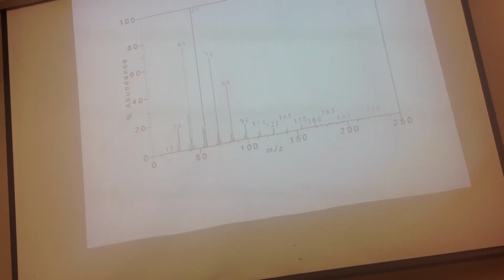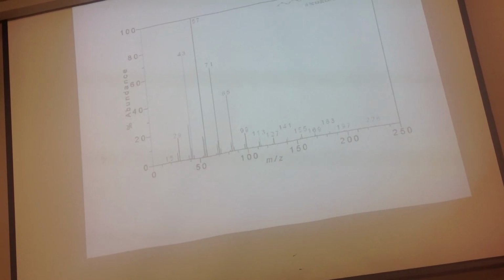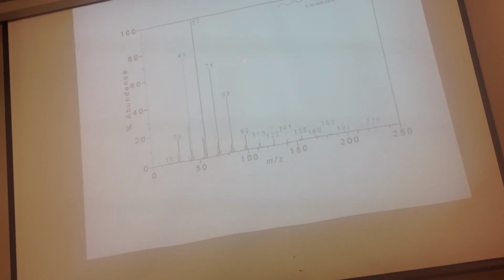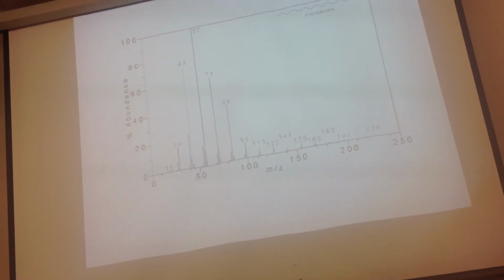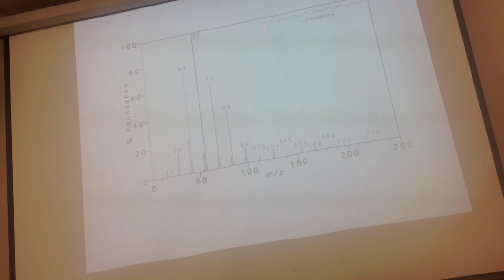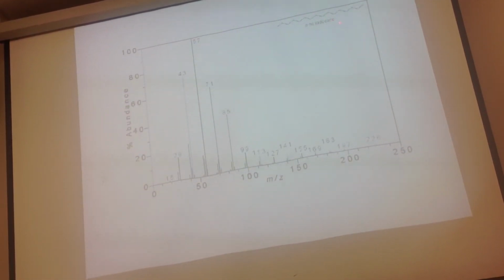Okay? You guys see the bell-shaped curve? It's skewed towards pieces that are 3, 4, 5 carbons big. So if you look at that bell curve, it's right here is where it's really tall. 3, 4, and 5 carbons. That's because there are a lot of ways of getting 3, 4, and 5 carbon pieces out of that molecule, different combinations.